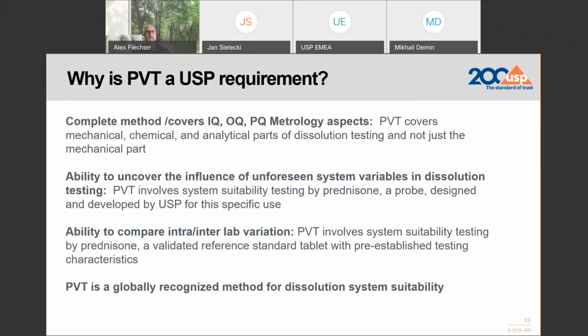Why is PVT a requirement? As I said before, it's a holistic test, and it encompasses all the metrological parts that you do before, but gives you a holistic answer of the test performance.